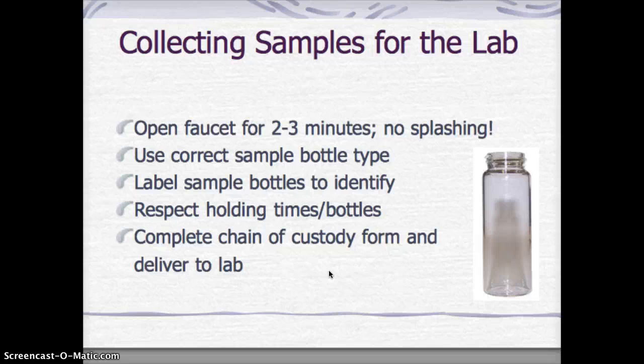You want to label your sample bottles to identify. Often the bottles that you get from the lab will already have labels that you just need to fill in. You need to respect the holding times for each of the different kinds of samples and the different kinds of bottles, and complete that chain of custody form and deliver that to the lab as soon as possible.